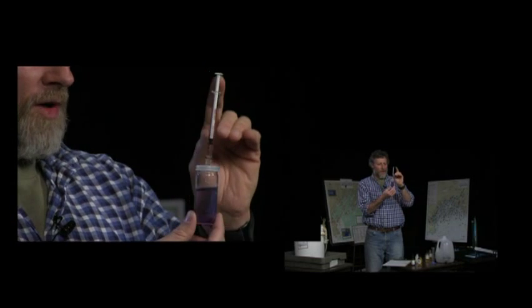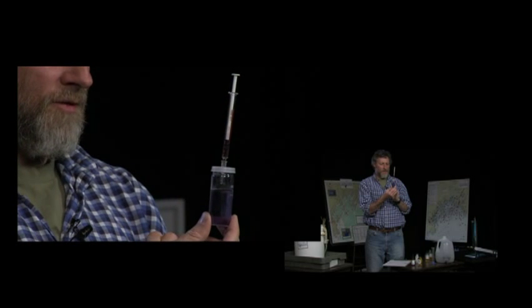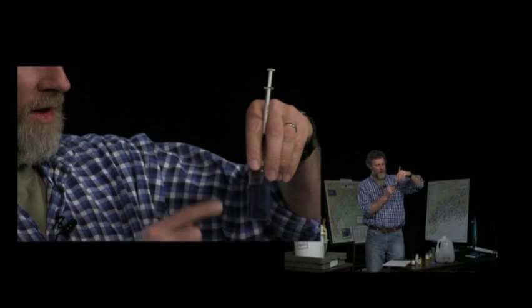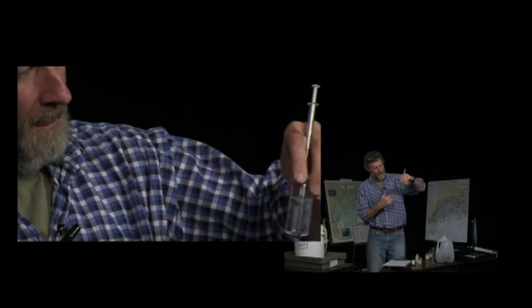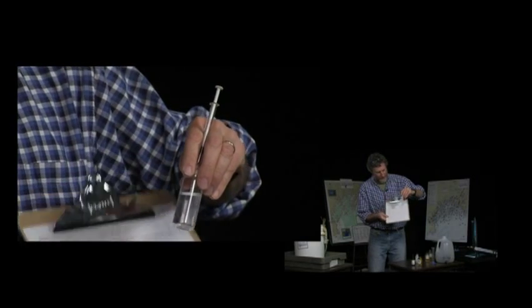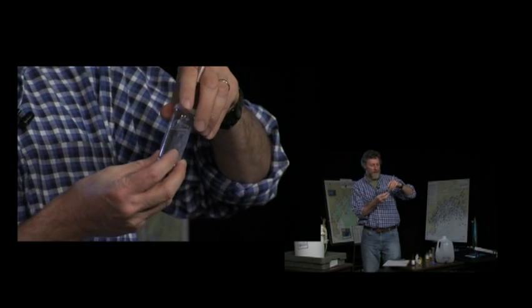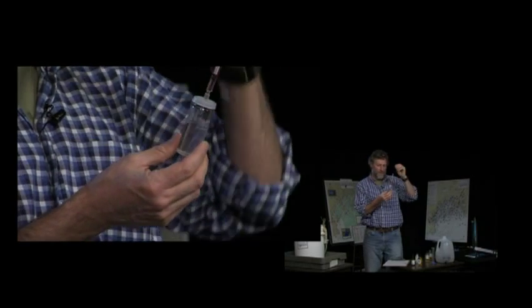By doing a half drop, which is putting it to the end so that it dangles on the end and doesn't fall in, is typically about 0.1 milligram per liter. So you can get a little bit more refined. So have one dangle on the end and you can kind of splash it off, and that'll make it turn clear. I could have continued to push it through so that it was 0.2, but if I practice it enough, you can be a little bit more accurate with your measurements.